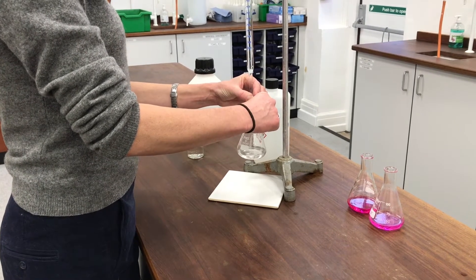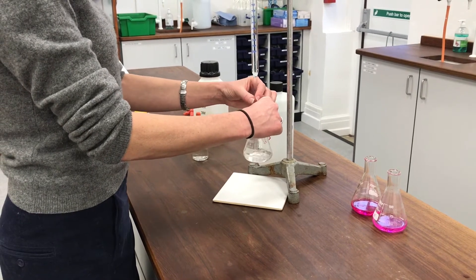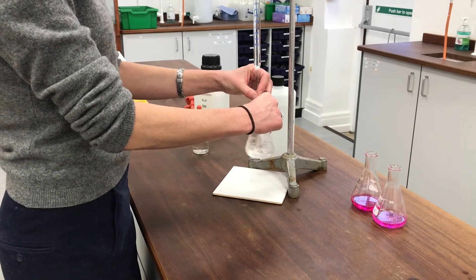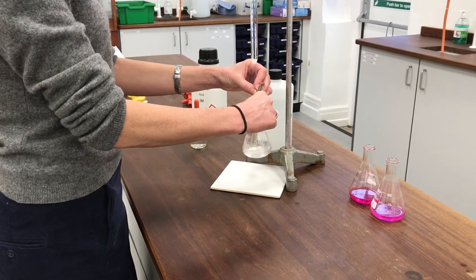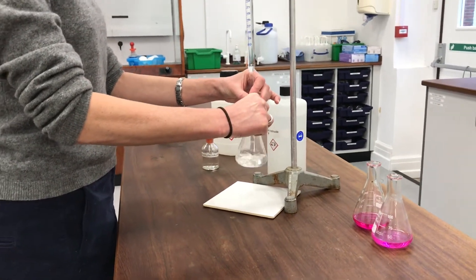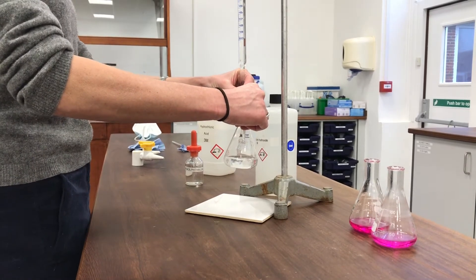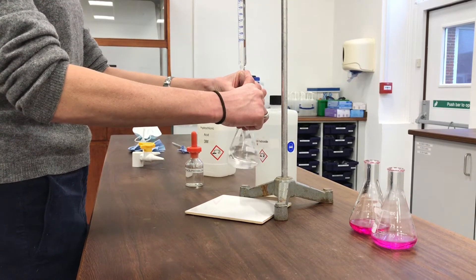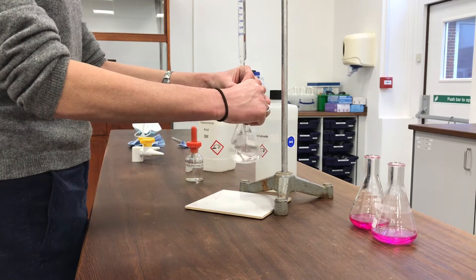I know from the titres I did with the hydrochloric acid that I need to add at least 15 millilitres of sodium hydroxide to neutralise the HCl present in this mixture anyway, so I can add 15 mL rapidly. Then I need to start watching out because at that point I'll be titrating against ethanoic acid in the mixture, and I won't know exactly what quantity is there. I've just passed 16 millilitres and I can see some tinges of pink in the solution, so I'm going to be a little bit more cautious in how I'm adding sodium hydroxide.